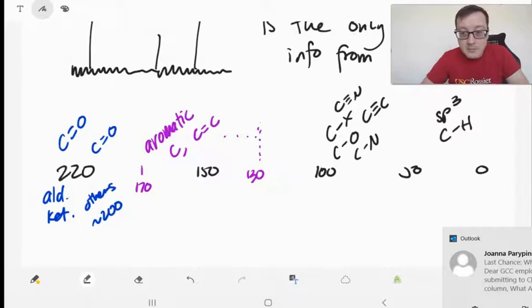So a lot easier than proton NMR, right? We only have a very few flavors of carbon. We have plain old CH for sp3 carbon, 0 to 50, 20, 30, that's normal. We have our sp carbons as well as heteroatoms next to carbons between 50 and 100. Then between about 130 to 170, we have our aromatics. And then above that, we have carbonyls. And that's it. Ta-da! That's all we need for carbon NMR.